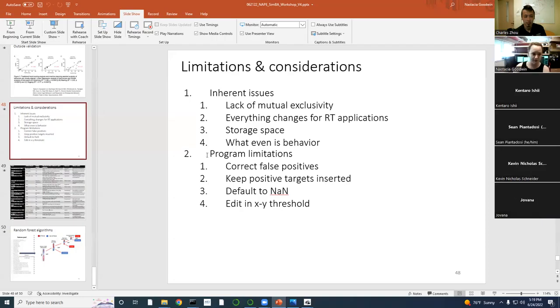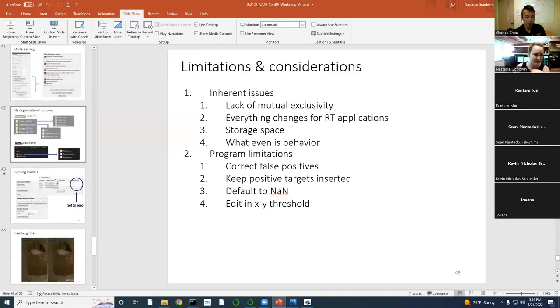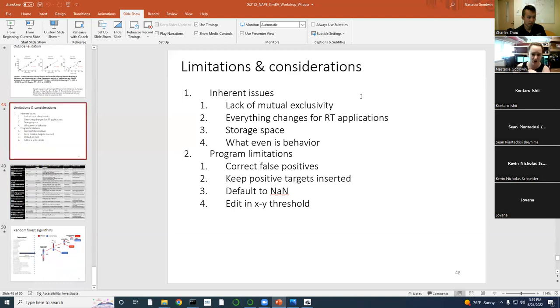I see. But what we're trying to do in that advanced behavior annotation is to make all of this more automatic and easier, and to get that probability plot, to get everything pushed apart. I'm really looking to make a platform where you can pull all of your frames that are between like a 0.4 and 0.6 threshold and just correct those.